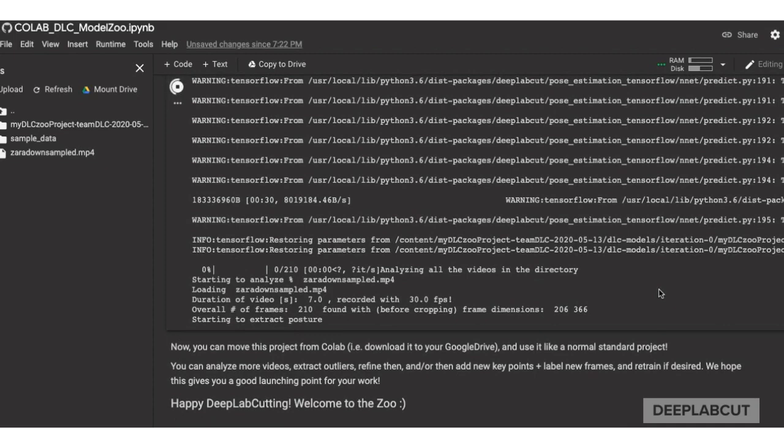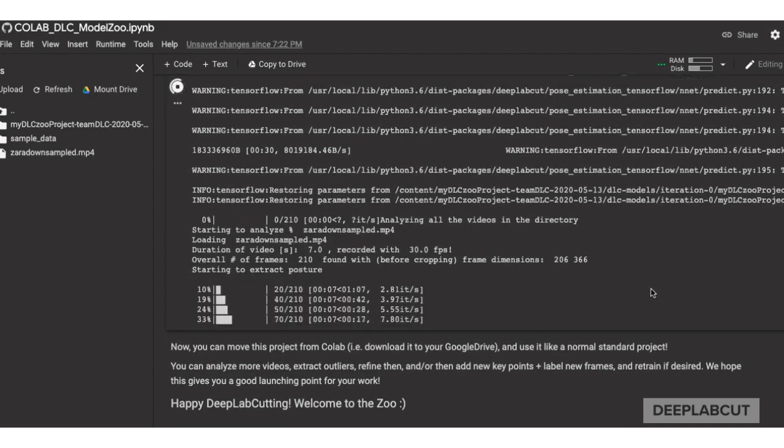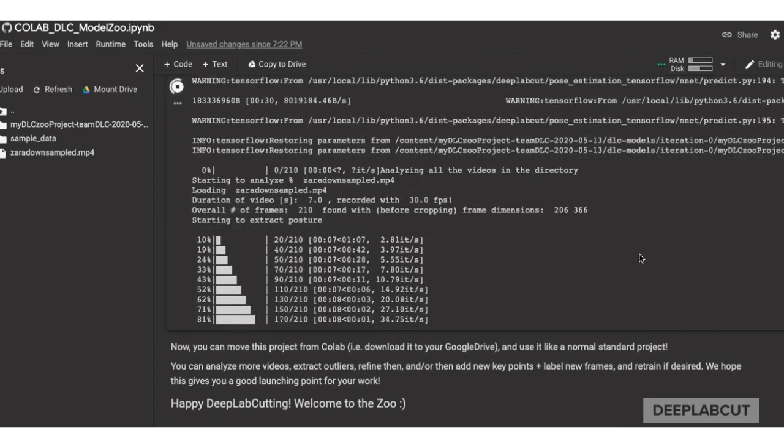So I let this video play just to show you how long it actually takes in reality. So it's not very long.